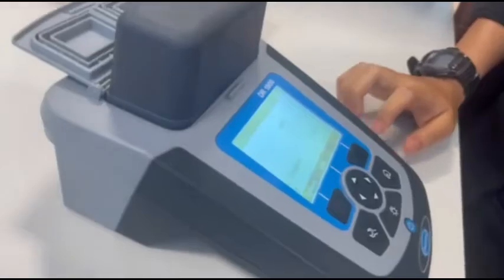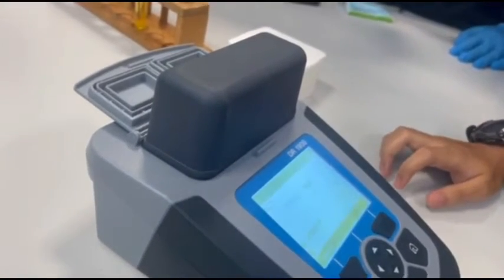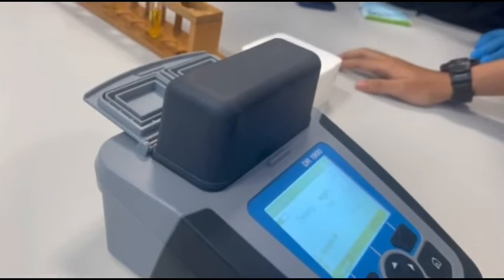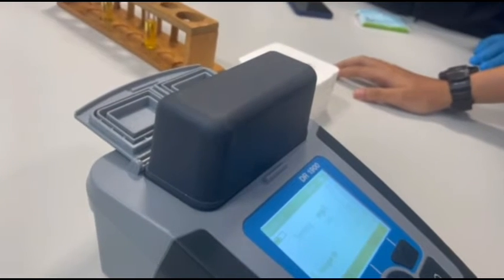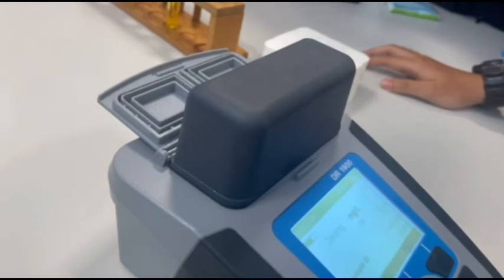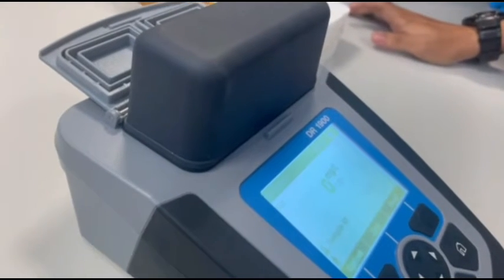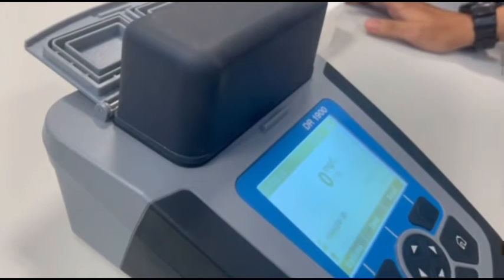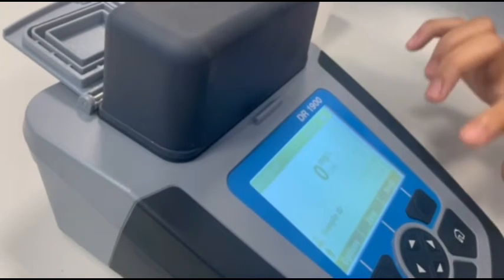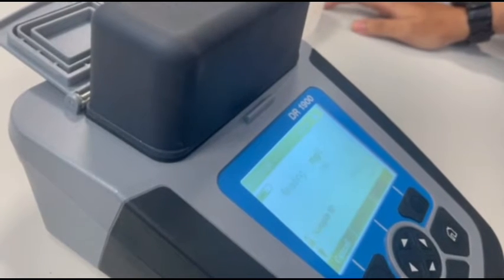Slowly refill with dilution water if needed into the BOD bottle and put on the lid. Repeat steps 5 to 7 for another BOD bottle. Store the BOD bottles in the BOD incubator for 5 days at 20 degrees Celsius. On day 5, take out the BOD bottles and leave them until they reach room temperature. Read the DO from each sample and blank. Record the value as final DO.